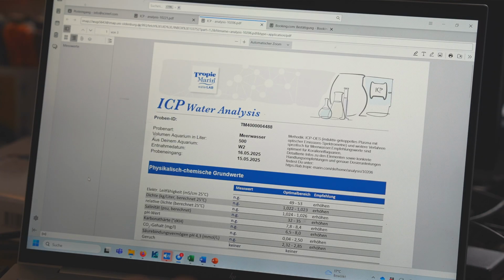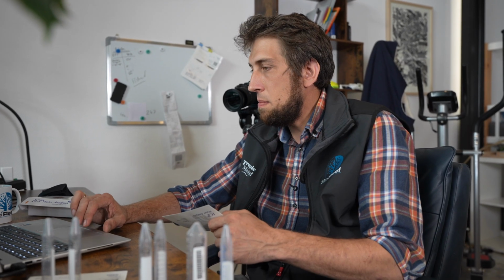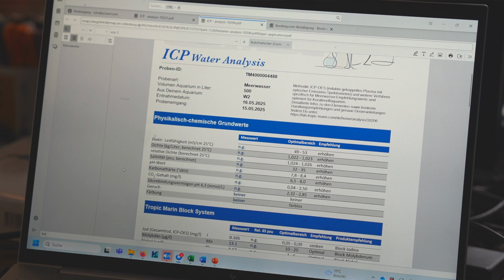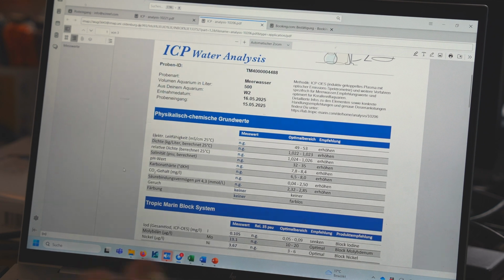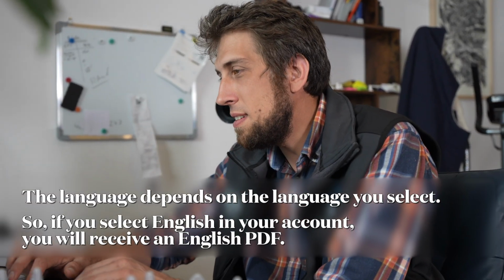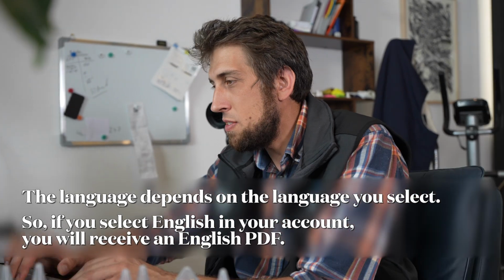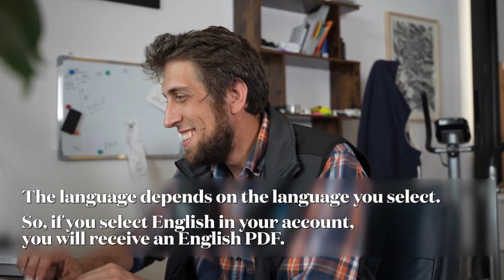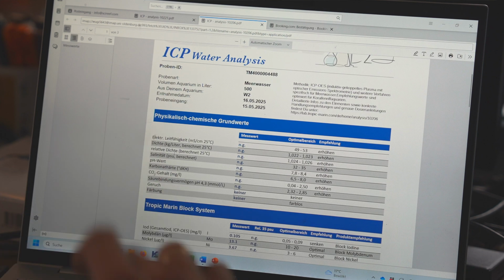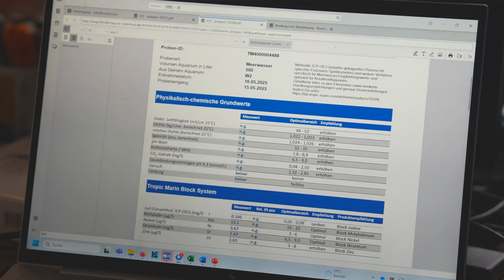So I have one open right here. This is now a sample for the ICP, not the plus. We can now look at that report that you get. First category is actually, it's in German. I'm very sorry, but I can't change that PDF to English. You just have to trust my translation skills, I'm sorry. Basic parameters, which is like salinity, pH, KH, etc. That is measured only in the plus, so we don't have values for that here.